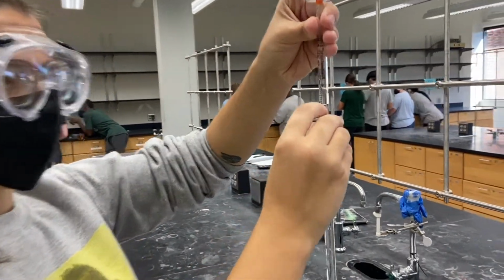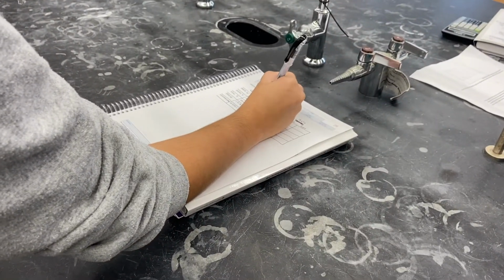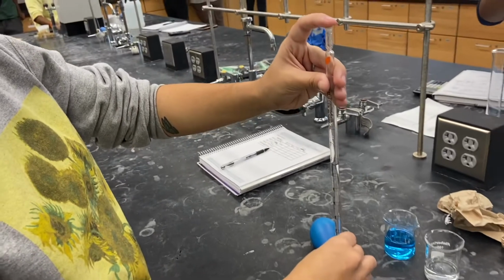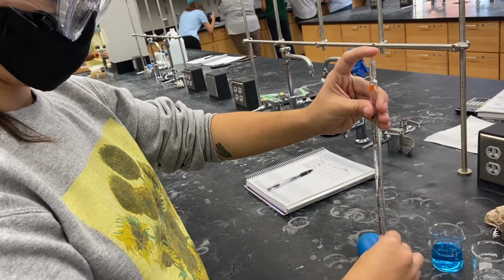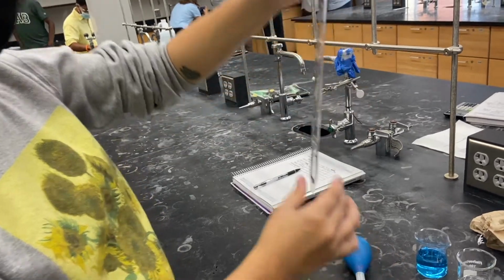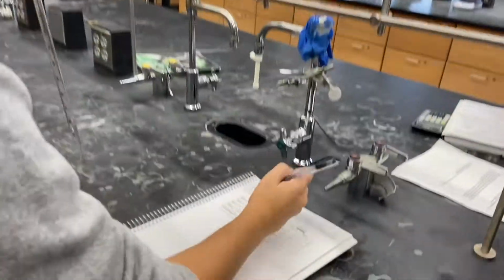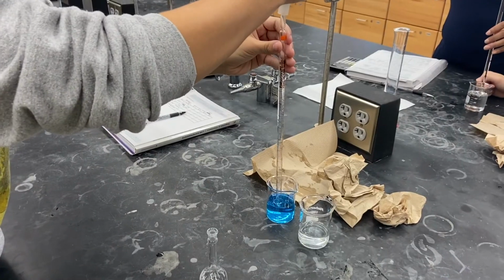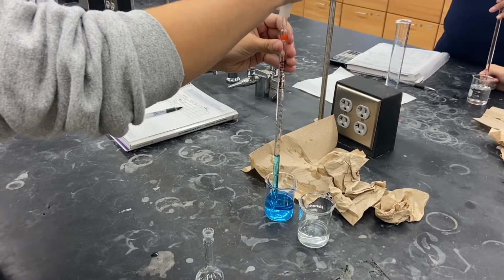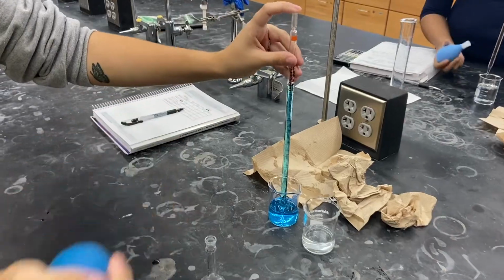C1 represents the initial concentration and V1 the initial volume. C2 represents the final concentration and V2 the final volume. We multiply the initial concentration, 20% or 0.2, by the initial volume, which we calculated by determining the volume delivered by the pipette. This is set equal to the unknown concentration, or C2, times the volume determined by filling the volumetric flask to the mark with water, which is 25 milliliters. By solving for C2, we find the concentration of the dilution.